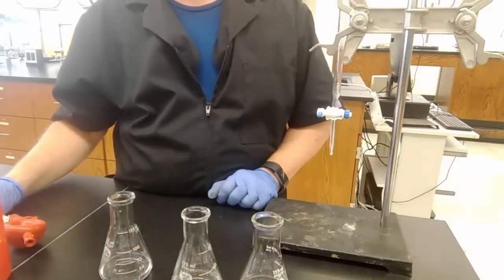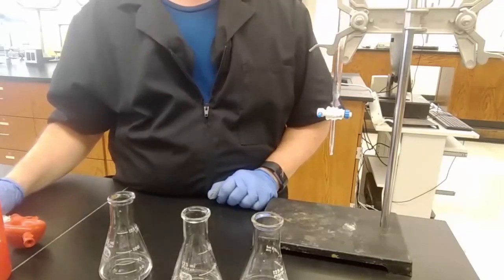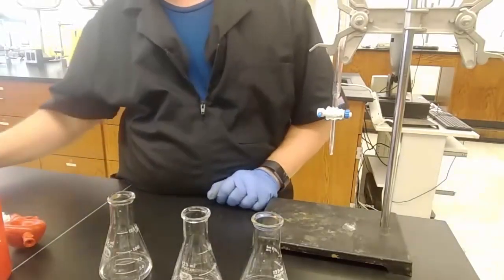We have 10 milliliters of vinegar. It has a certain amount of acid in it that we're trying to measure through this titration, and that amount of acid is already in there. Adding extra water, as long as it's deionized, isn't affecting anything.